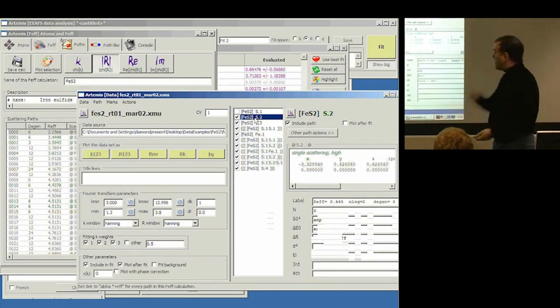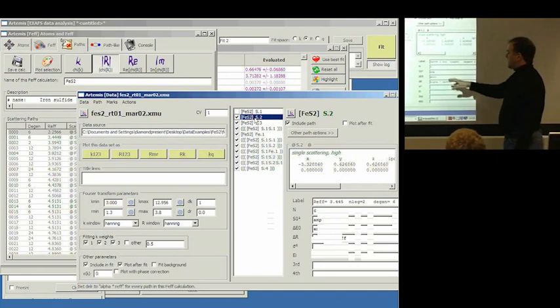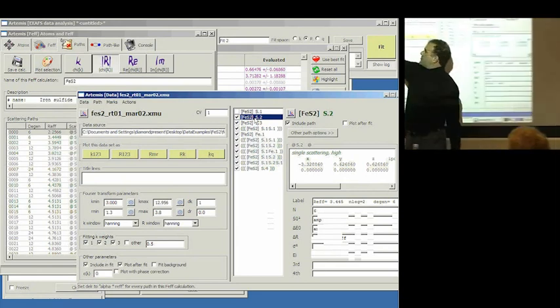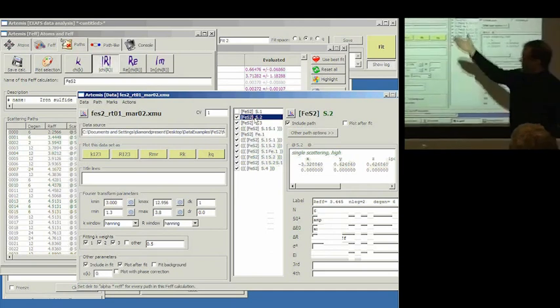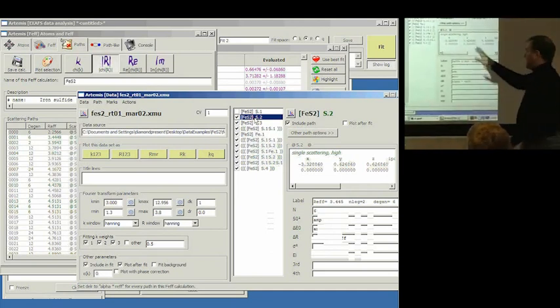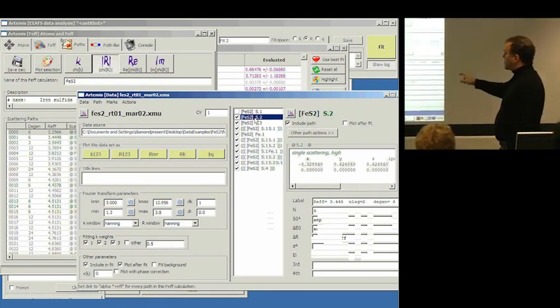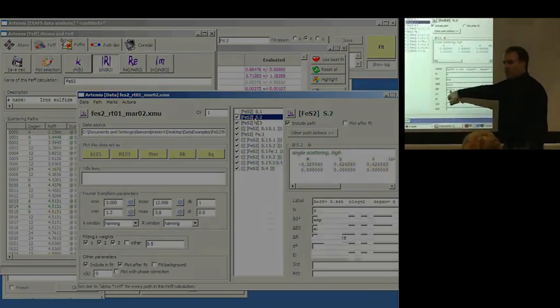So we have alpha times ref as our parameter. As we'll see in a second, alpha will evaluate to some value, and when we go and look at what delta r is, the delta r's will be monotonically increasing or monotonically decreasing path by path. We'll see that in a second. Okay, so because this is a cubic crystal, we get all of our delta r's from a single parameter. So we've improved the situation here yet again.